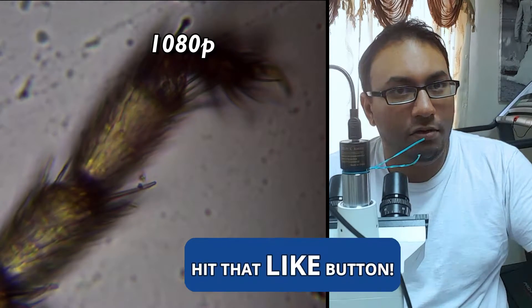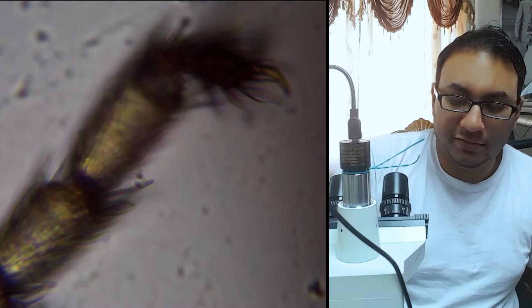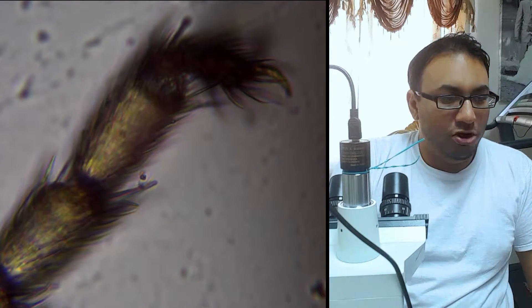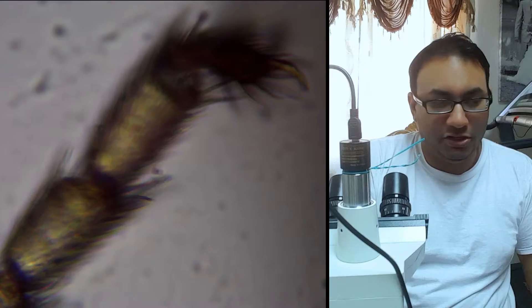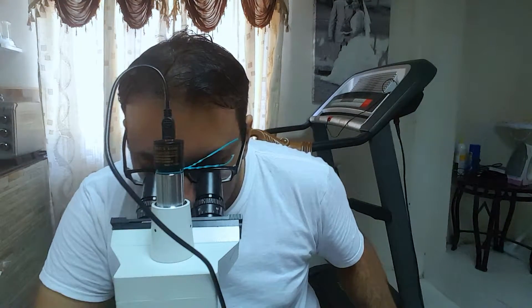The area around is the glass, and I don't have the most perfect glass. That's at 400X. The only other magnification I could go to is 1000X, and chances are it would be too dark to show — but I'll just try it just in case. As I suspected, that is too dark to be seen. I can actually see something under the microscope, but it doesn't appear on the camera side of things.